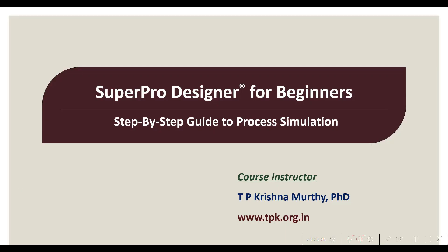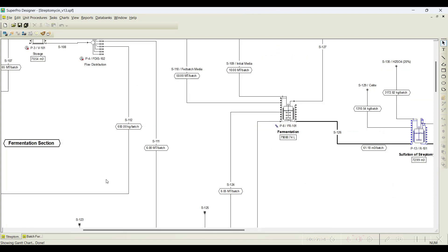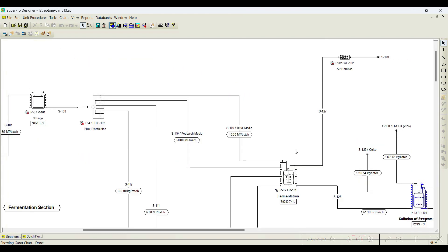Namaste, welcome to the tutorial series on SuperPro Designer for beginners — a step-by-step guide to process simulation. In the previous tutorial we understood how to set up the inoculum development procedure as well as the fermenter in SuperPro Designer. When you see the original file of streptomycin production process, it is not a batch process.